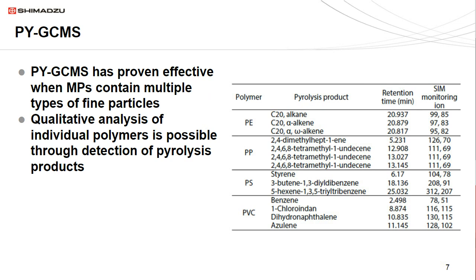In this application, we will cover the experimental methods of the analysis of microplastics by PY-GCMS. Starting with the sample prep, approximately 0.05 milligrams of the 4 types of commercially available standard polymer samples, like polyethylene, polypropylene, polystyrene, and polyvinyl chloride fragments, were all weighed and placed into the same sample cup. And about 1 milligram of wool was placed over top to prevent scattering during sampling.